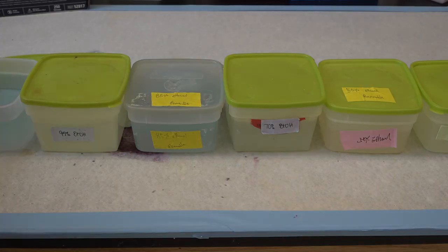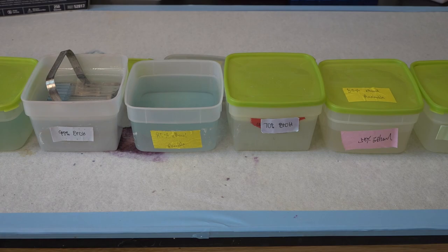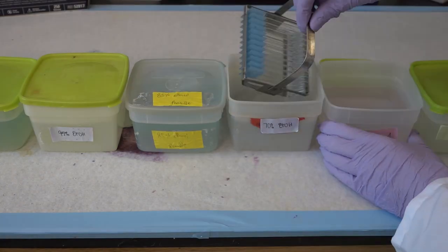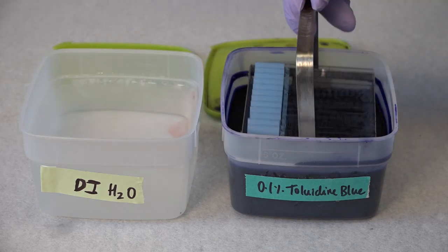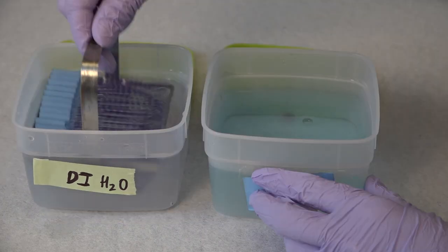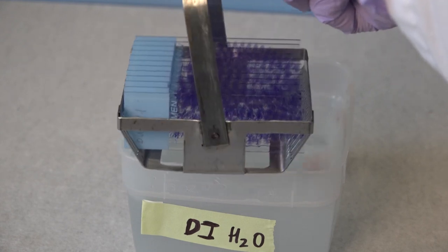So here are my slides in a handy slide rack, and I'm putting them through a series of chemical baths to wash away the wax and get them ready for the stain. Then it's toluidine time. We just dunk the slides right in there for a couple minutes and then rinse, rinse, rinse till the water runs clear. And look at that. The sections are so visible now.